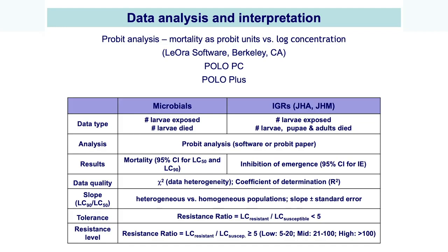These parameters vary upon the quality of the data in the bioassay, mosquito species, population genetic diversity, and mode of action of pesticides tested.